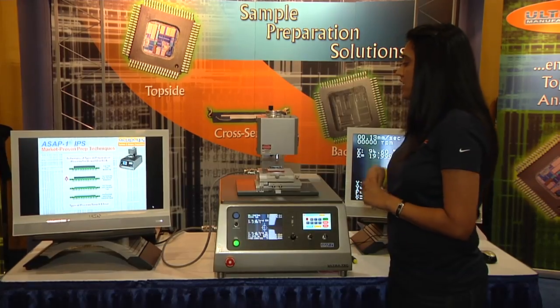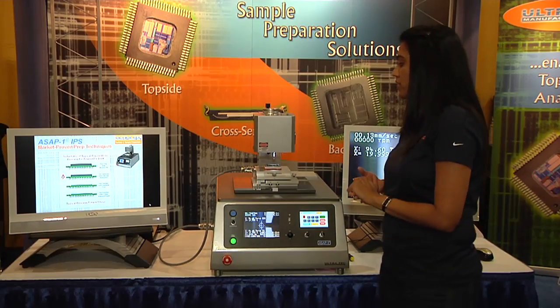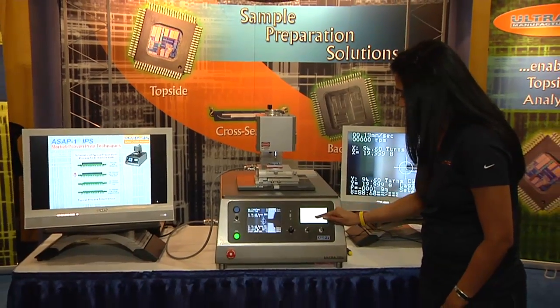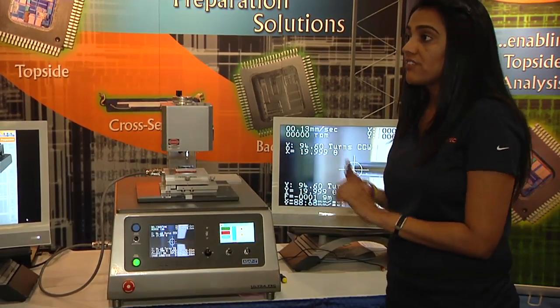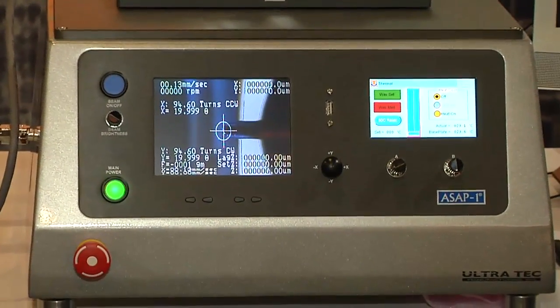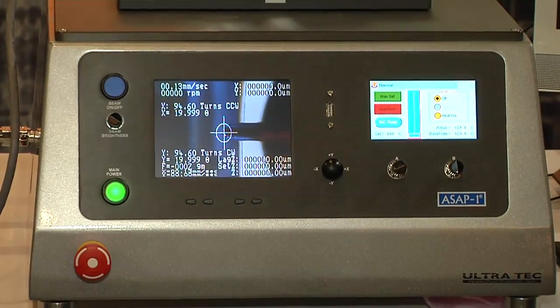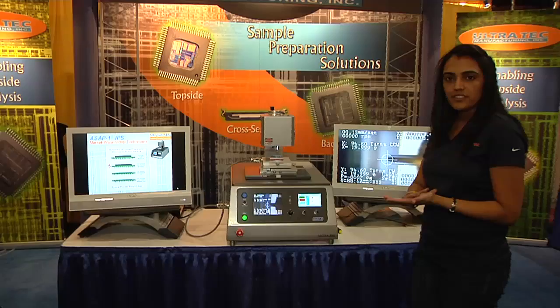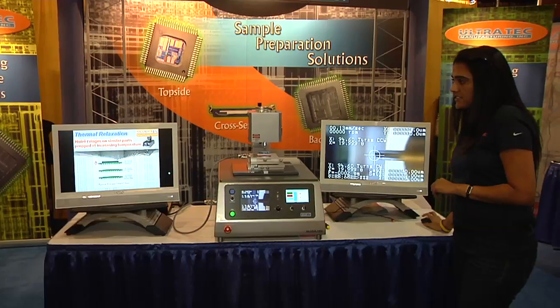The thermal stage is the thermal plate itself, with a cable that connects to it, which allows programmed capabilities to heat the sample according to the way you want. In the screen you'll see the thermal screen showing capabilities of mounting the sample using the wax set and wax melt, and setting a temperature that gives you the most relaxed state. You can see a flip chip with a bow die that relaxes when heated. A typical process getting down to 100 microns or less can be within an hour.